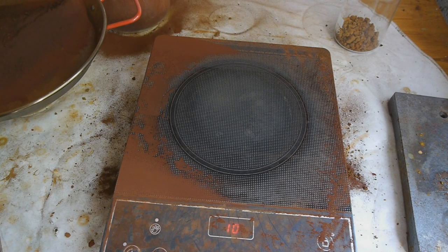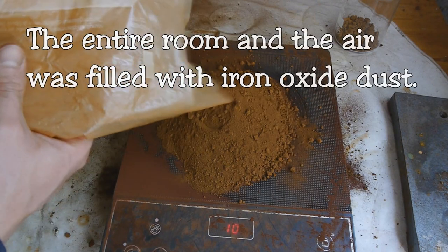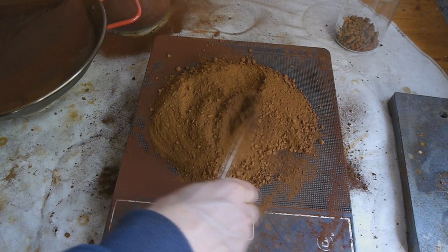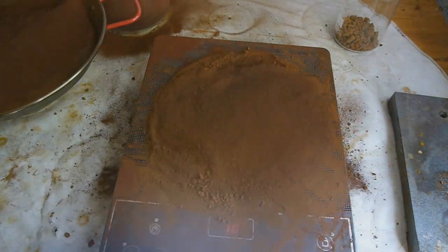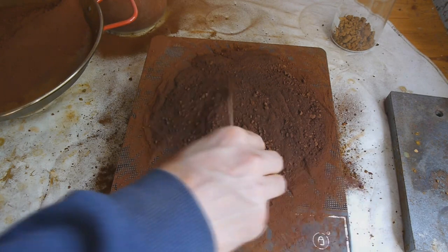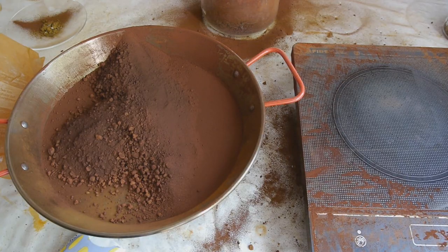Now for the last batch, I think I figured it out by now. So like this, it works really amazing. We basically just have to lift up the iron oxide that's underneath and eventually it will all turn red. Now this needs to cool off and then everything needs to be cleaned.